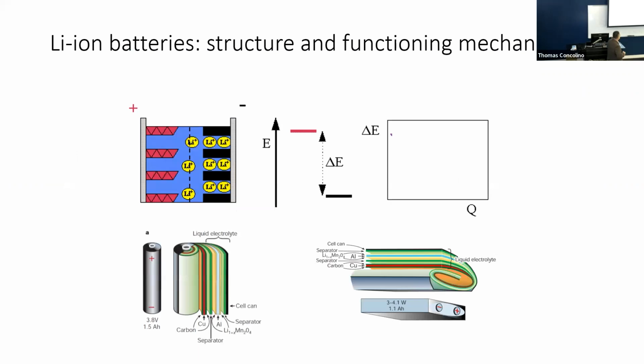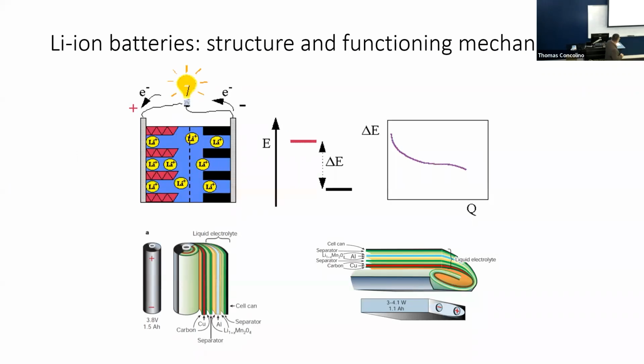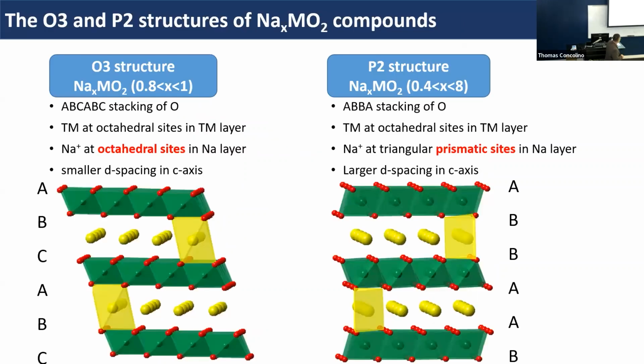All right. So again, this is the structure. We focus on the cathodes, the layered material, and this is today's topic. We focus on XRD, and now I have to apologize. I have to skip a lot of details of the materials with limited time, but I will try to deliver the most important information.